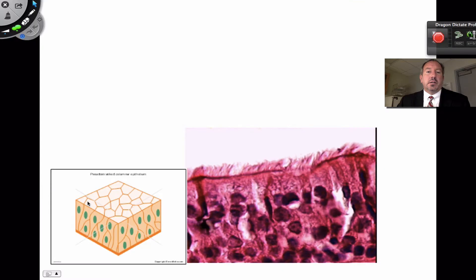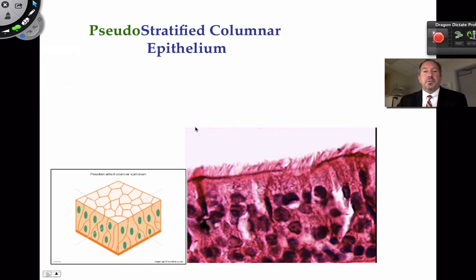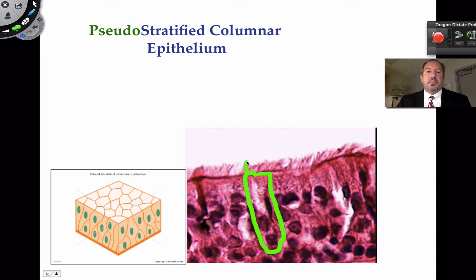Let's go over here and I'll click this to enlarge it. So this particular tissue is pretty interesting. What I look at when I'm looking at this tissue, I see there's free space. That's a characteristic of the very first cell layer you're dealing with — it's epithelial, and things below that are not epithelial. Do you notice there's like a little hair coming off? So here's a cell. This is called pseudostratified ciliated columnar. If you have a cell like this, the top of the cell has little protein extensions coming off called cilia, and that's what's coming up above here.